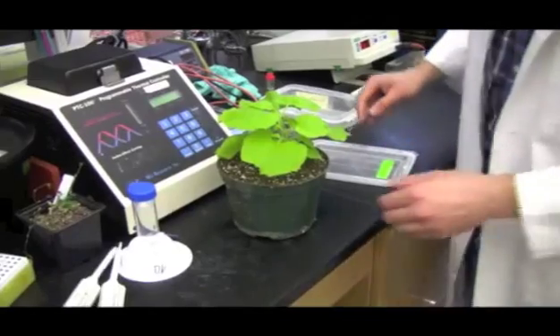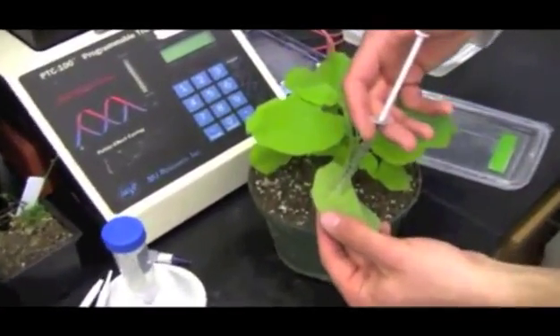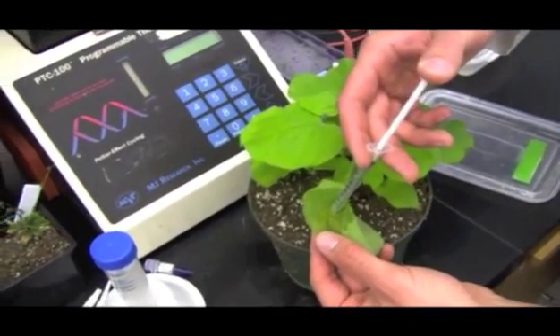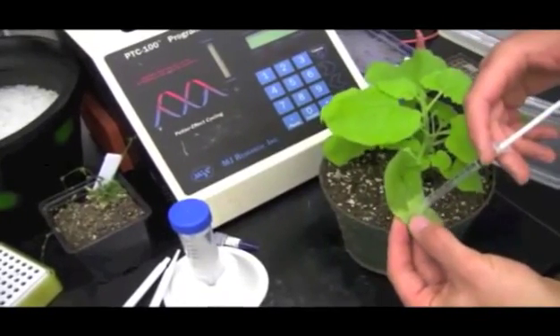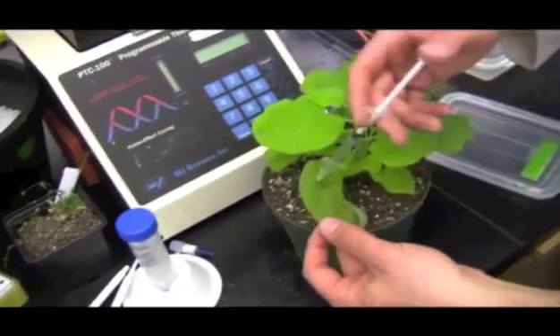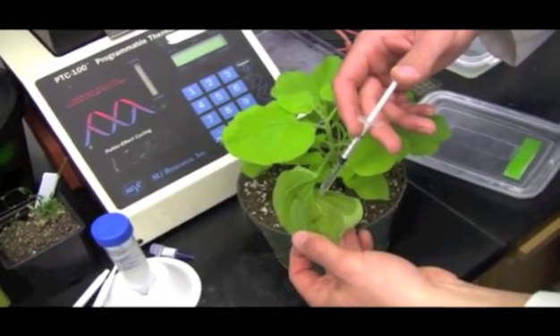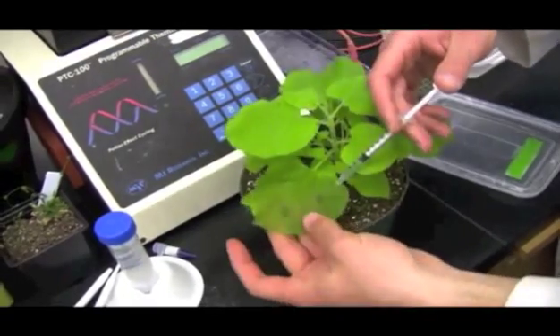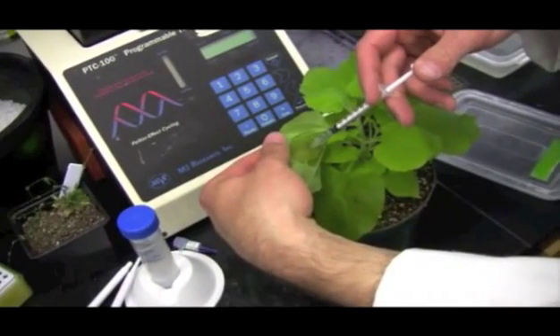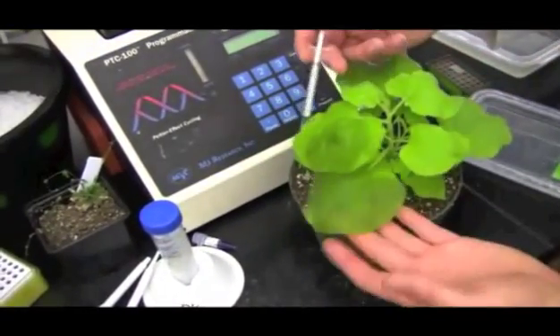Cool. Alright, now we infect. So, can you guys see that? A little bit. Alright. So you see that little liquid fill throughout the rest of the leaf, and so you're basically filling little pockets of air that are inside of the leaf, because plants need carbon dioxide to do photosynthesis. So we're replacing that air with this liquid, and that liquid has the bacteria in it. So I'm going to fill this whole thing. Maybe do this one just for fun. Oh, that's a good one. One fell swoop. It's cool.